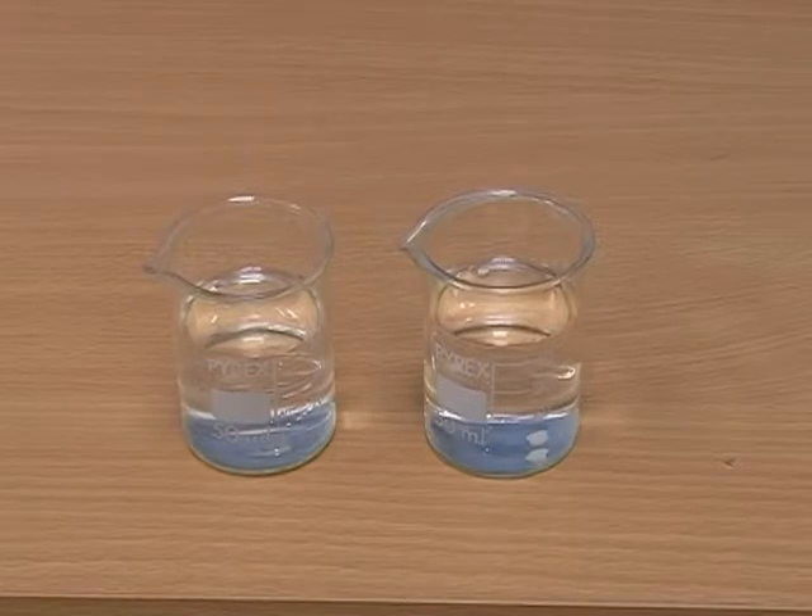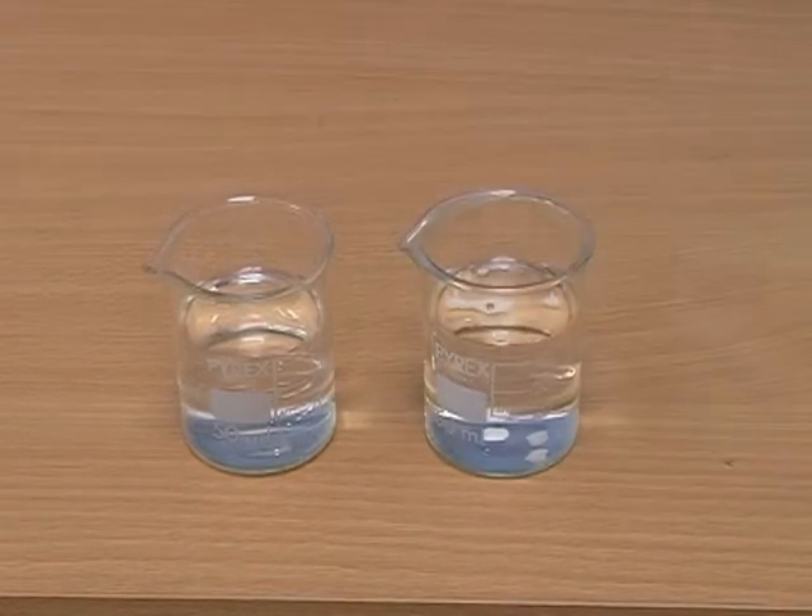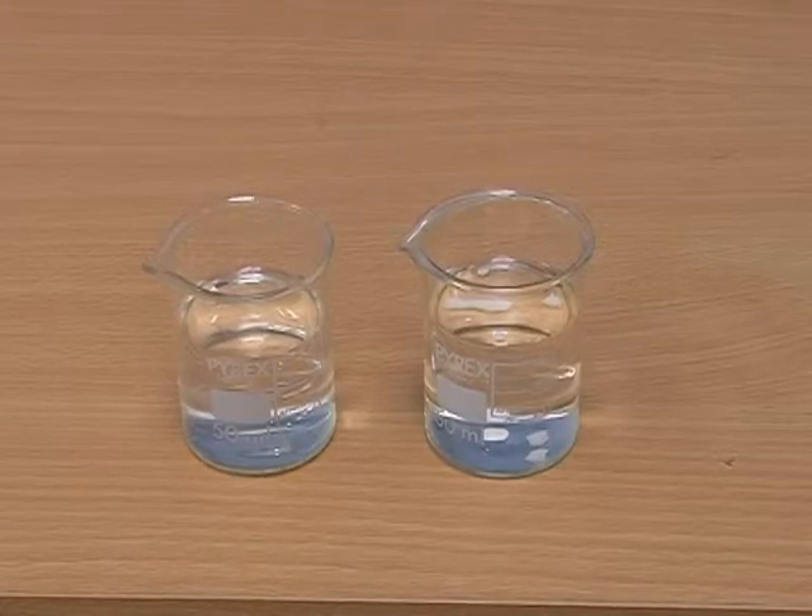Here is a simple experiment to demonstrate the flotation principle. If I place a piece of polymer into alcohol, we can see it sinks straight to the bottom, so the density of the polymer must be greater than the alcohol, which is about 0.79.